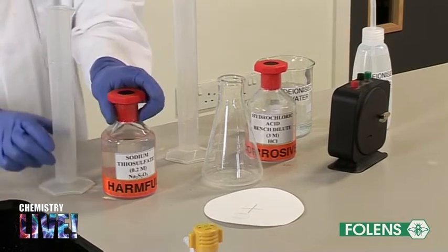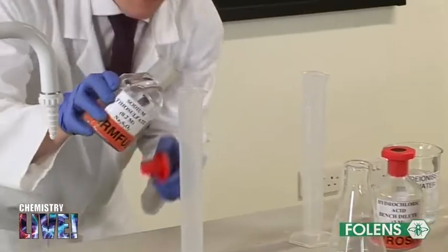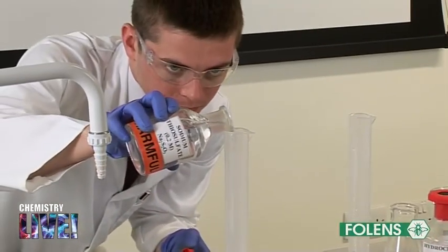Using a graduated cylinder, pour 100 centimeters cubed of 0.2 molar sodium thiosulfate into a conical flask.